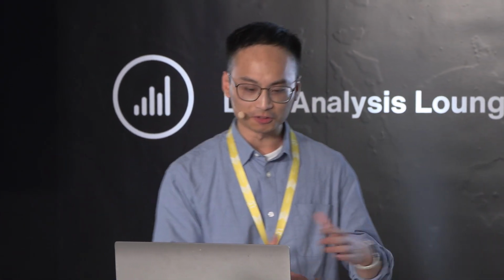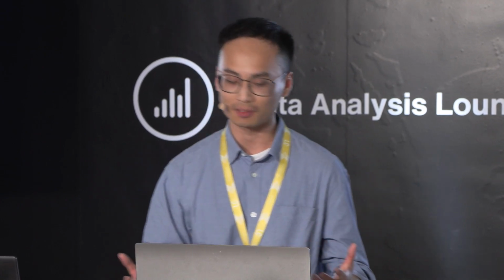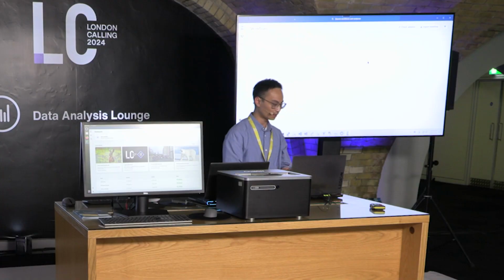So first, what we're going to do is get this workflow up and running. And after that, we're going to try and simulate a sequencing experiment. Unfortunately, because of time constraints and resource constraints, we can't really load a flow cell and do an actual sequencing experiment live. But what we can do is try to emulate or mimic a sequencing experiment as closely as possible by doing some base calling. So we'll take a look at that in a bit.